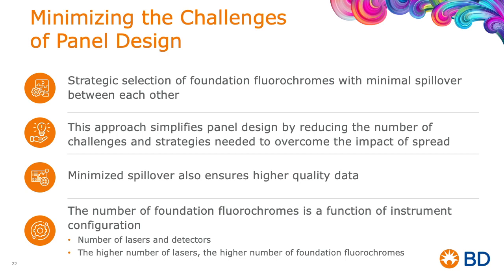So what I'm going to talk to you about in the last section of the webinar is a strategic selection of foundation fluorochromes with minimal spillover between each other. This approach simplifies panel design because it reduces the number of challenges and the strategies needed to overcome the impact of spread. Minimizing spillover and spread also ensures higher quality data because we are removing background.